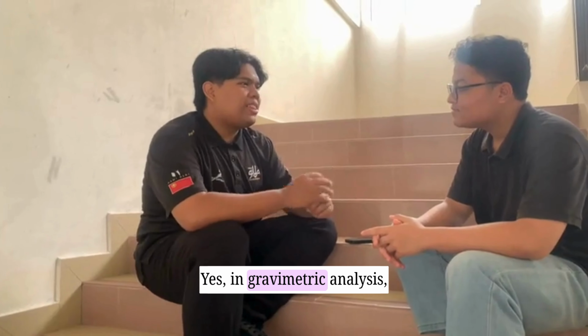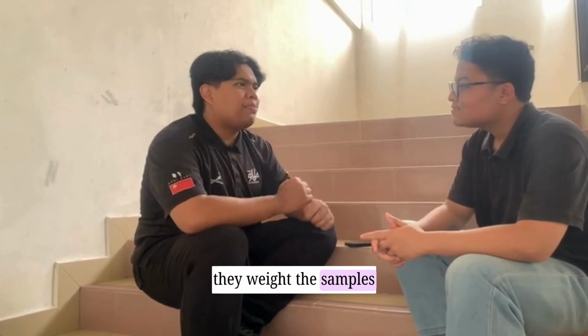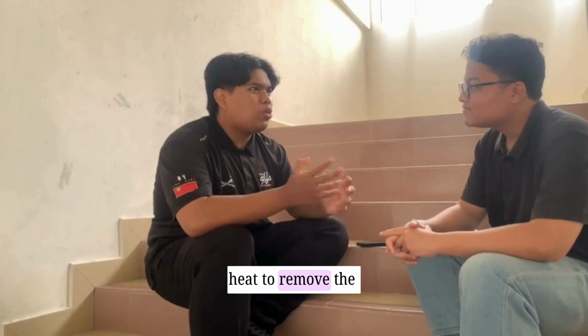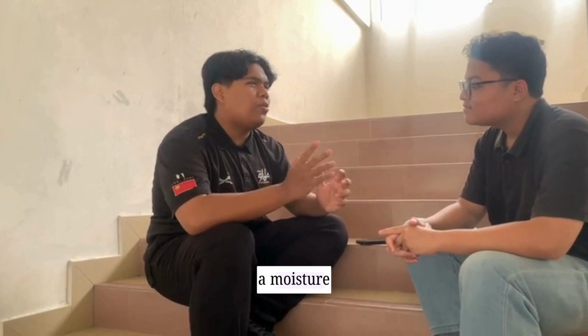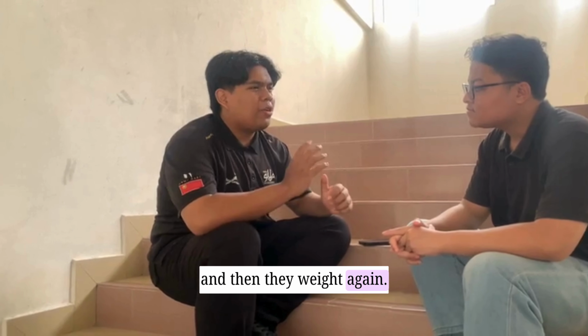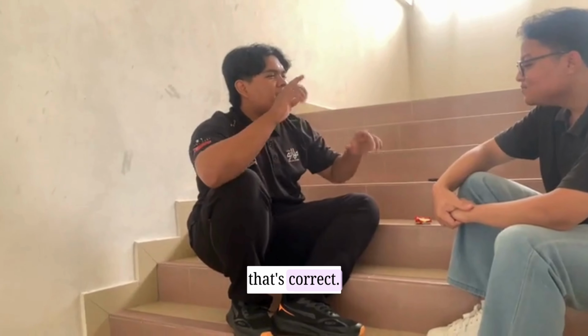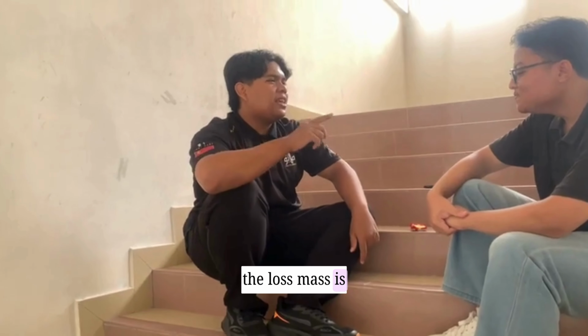Yes, in gravimetric analysis, they weigh the sample first to get the initial mass. Then they heat it to remove the water, which we know as moisture, and then they weigh it again. So, the difference is how much water was lost. Yes, that's correct. Actually, the lost mass is the moisture content in the biscuit.